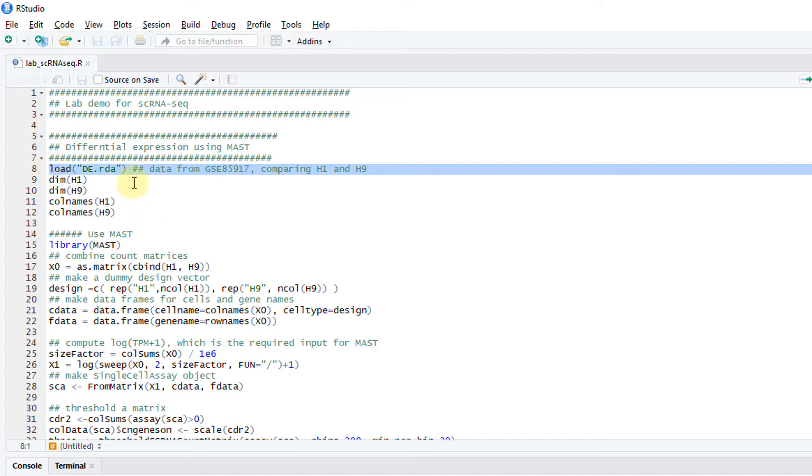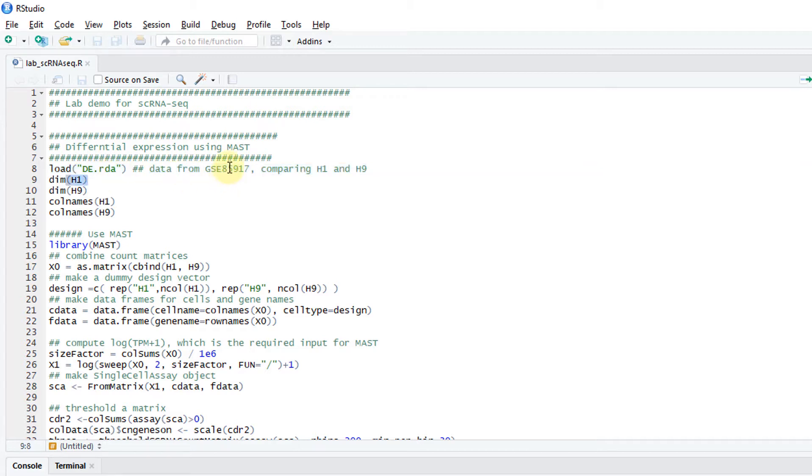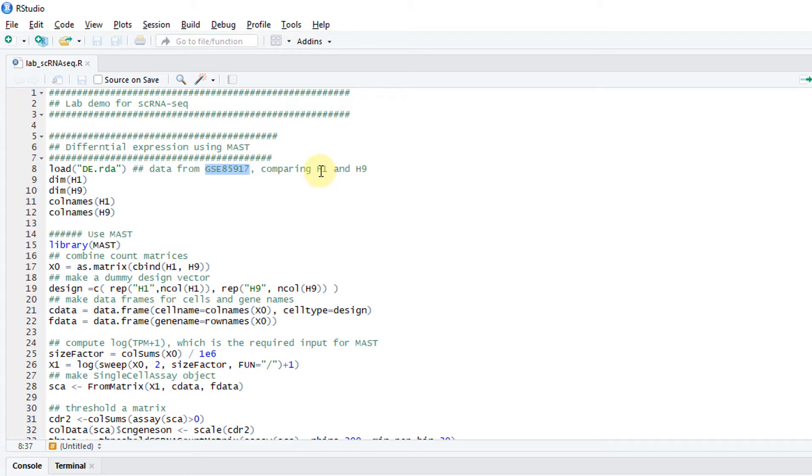We'll first load in the pre-saved file called de.rda. I obtained this data from a public data site from GEO under this accession number. The data is used to compare two types of embryonic stem cells, H1 and H9.